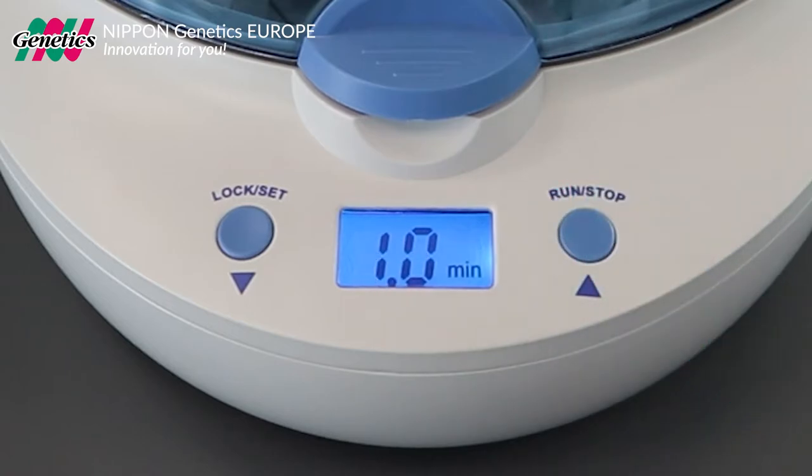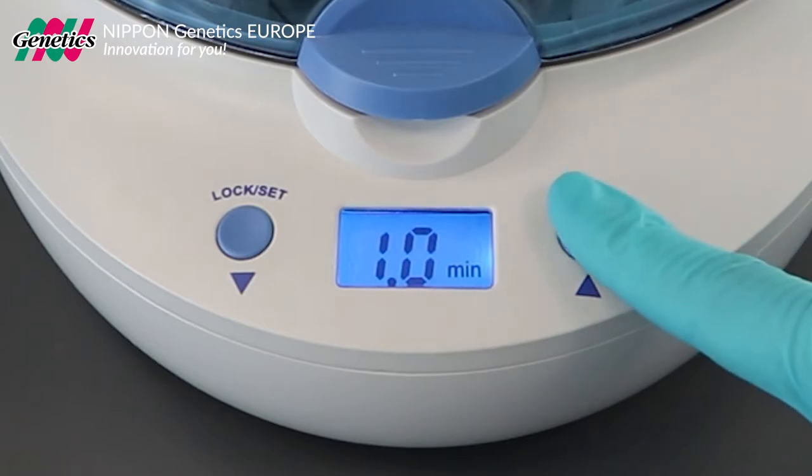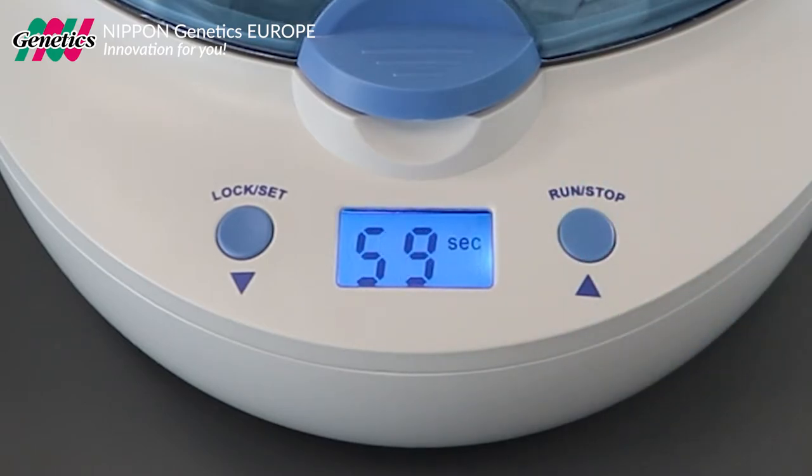The time can be set to up to 10 minutes. This ensures reliable and reproducible results. Press run to start the run.